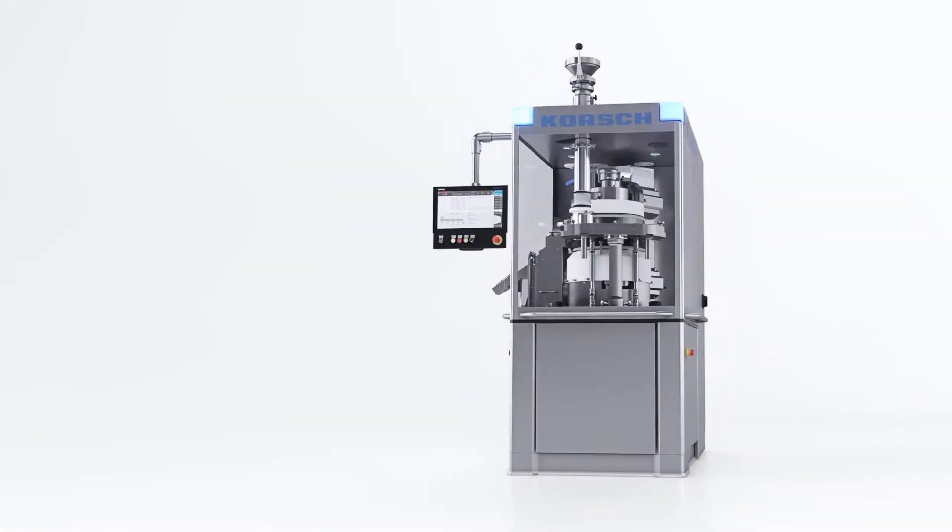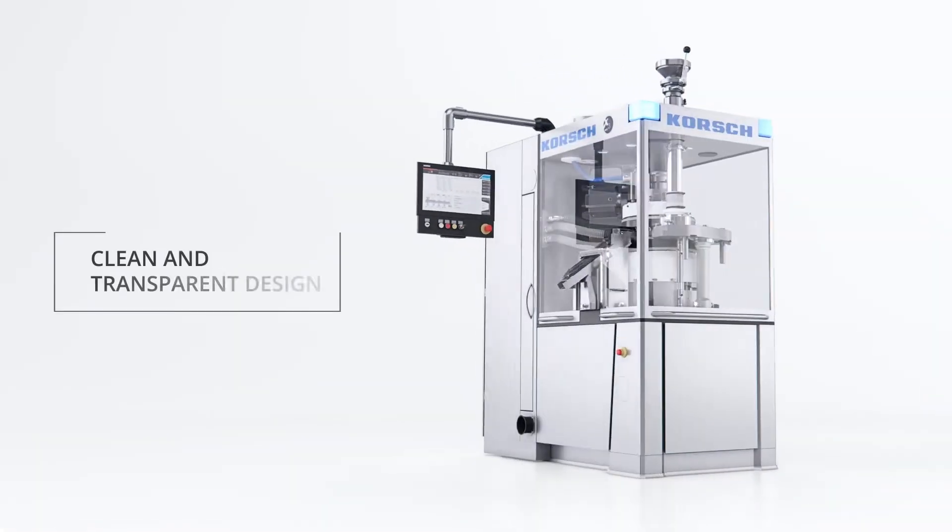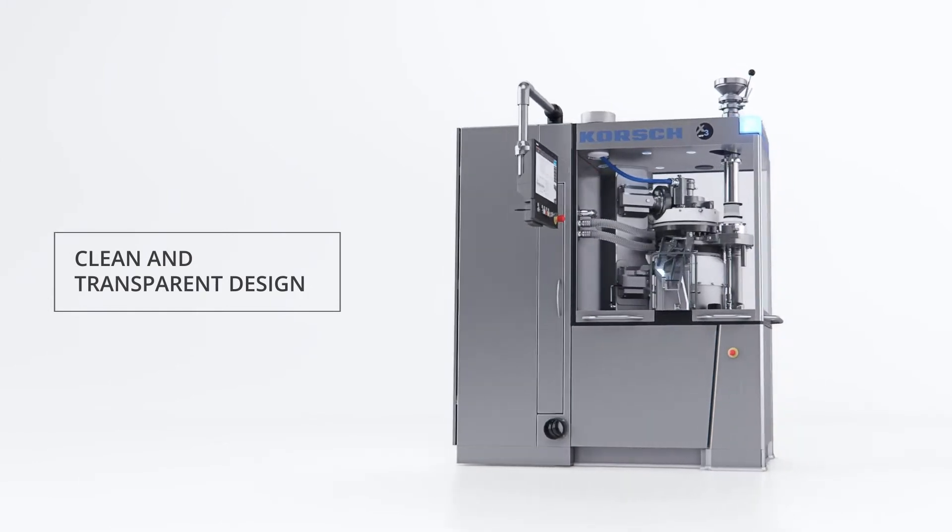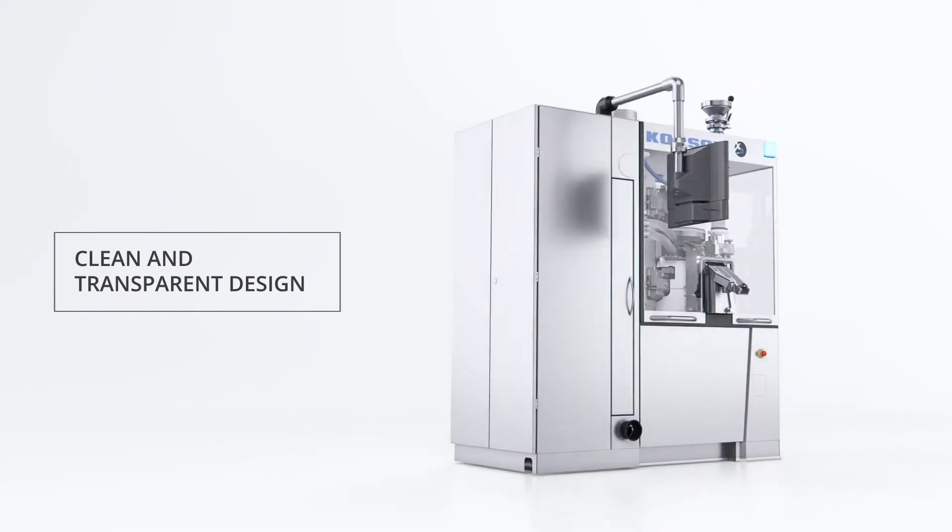The X3 is a breakthrough in the small-scale and mid-range tablet press segment, designed from the ground up to incorporate the latest Korsch advancements.